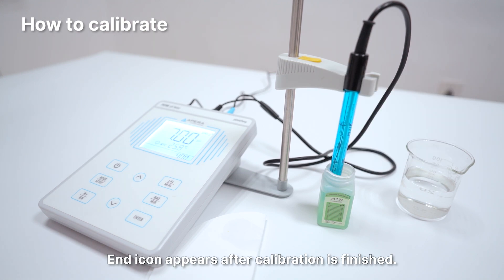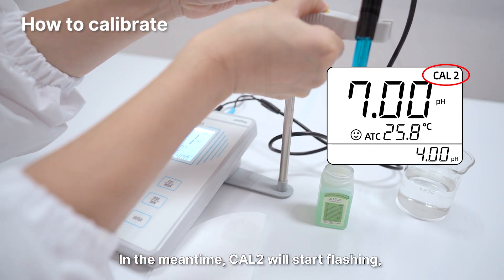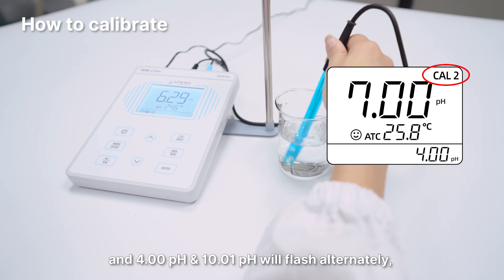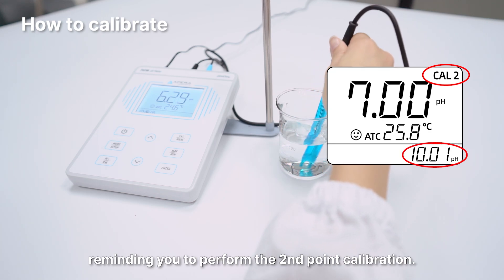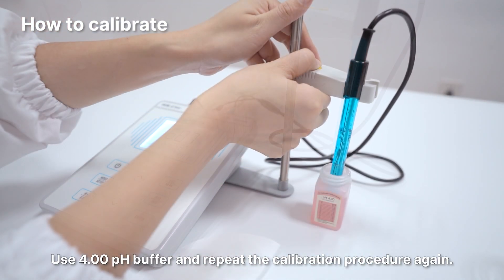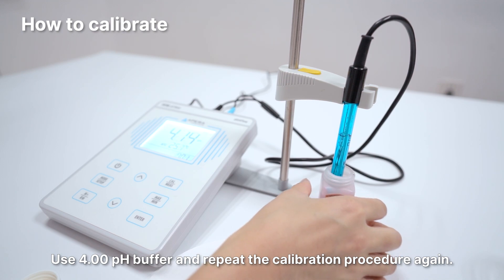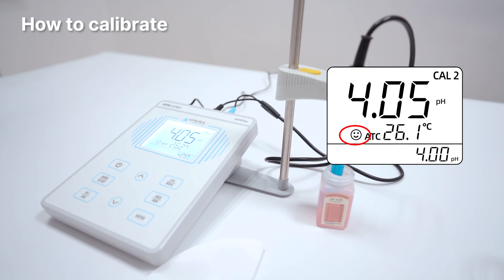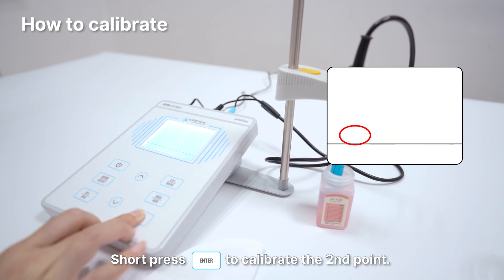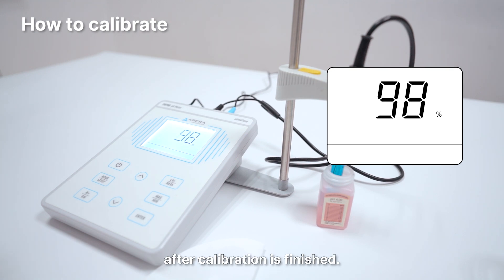The End icon appears after calibration is finished. Cal 2 will start flashing, and 4.00 pH and 10.01 pH will flash alternately, reminding you to perform the second point calibration. Use 4.00 pH buffer and repeat the calibration procedure again. When the reading is stabilized, the smile face appears and stays. Short press the Enter button to calibrate the second point. The End icon and the electrode slope of the acidity range will show up after calibration is finished.